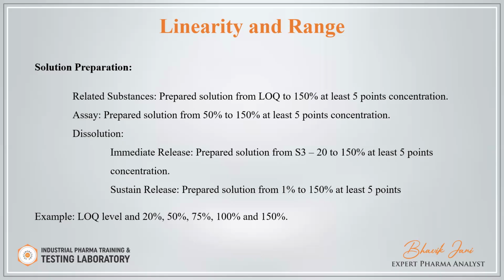For the assay, prepare the solution from 50 percentage to 150 percentage, at least 5 concentrations. And for the dissolution, if it is immediate release, then prepare the solution from S3 minus 20 to 150 percentage, at least 5 point concentration.